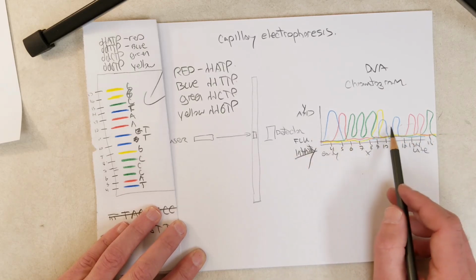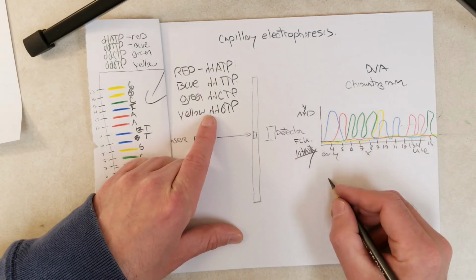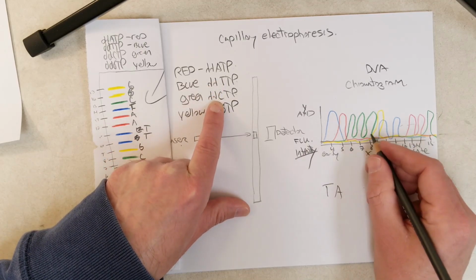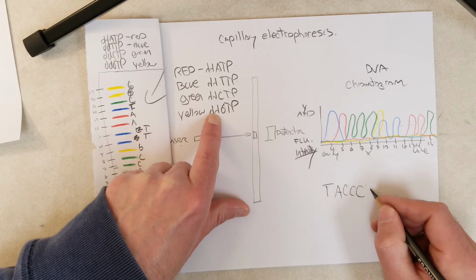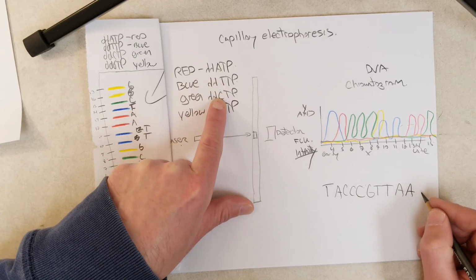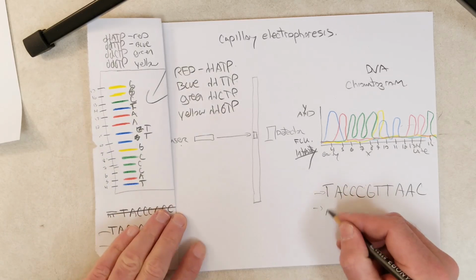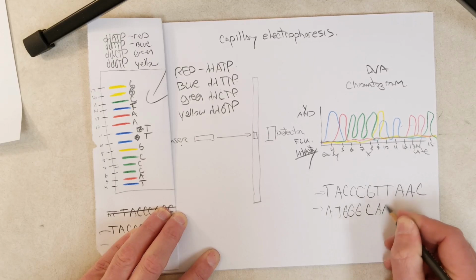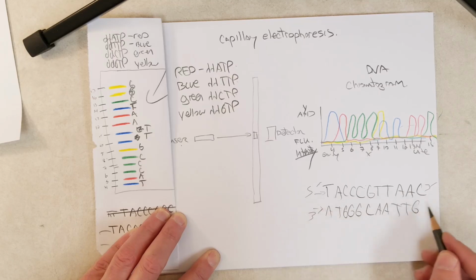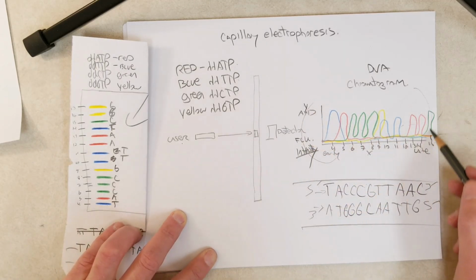But we can take a look at the chromatogram and see that, okay, we know what the colors mean. So the first one is T, then the next one, A, and then we have 2, 3 greens there, so CCC, then a G, then 2 blues, 2 reds, and then a green. And so, okay, that would be our sequence of the non-template strand. And then that's the sequence of the template strand. We're going to put our 5' and 3' ends in here. Okay, so that's how you read a chromatogram, and that's how those chromatograms are produced.